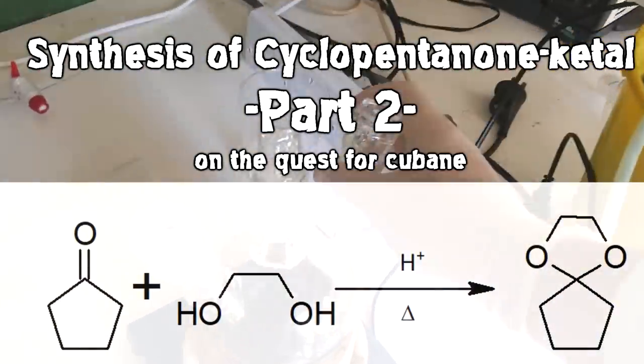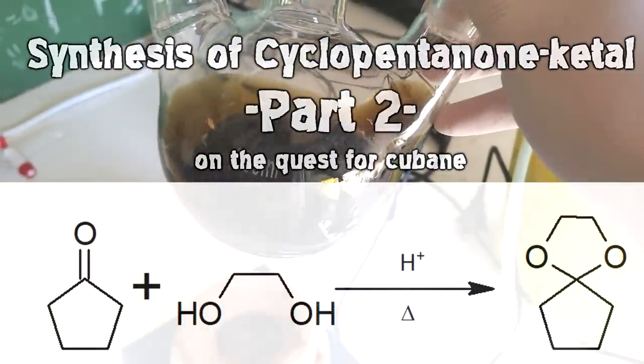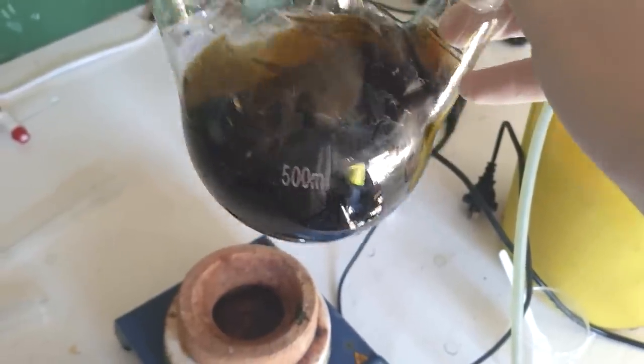Our solution in the flask here is pretty gross, pretty tarry. Yeah, look how much it sticks to the walls. So it's a bit thick. It's never what we want to see, really. We never want a thick solution.